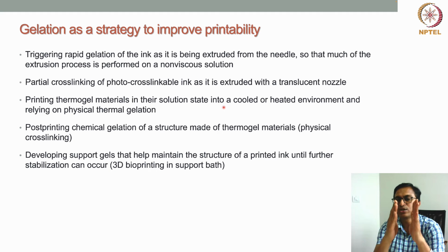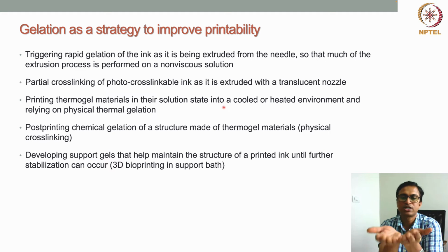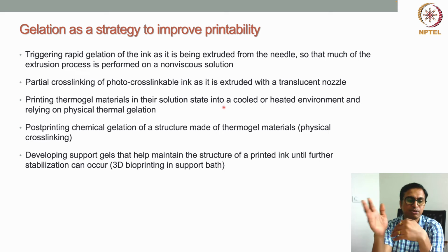During printing we need the material to be in a fluidic state. Accordingly, we can either cool or heat the syringe, but soon after the material comes out into the outside environment, if we can control that environment, for example the temperature of the printing stage, the material would be able to solidify when it touches the surface due to thermal gelation.